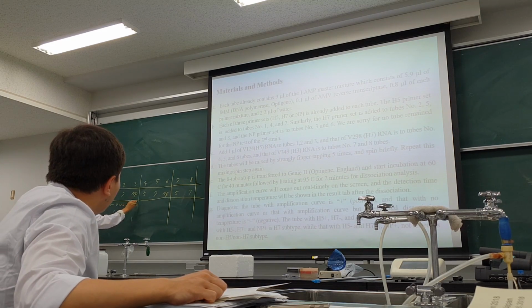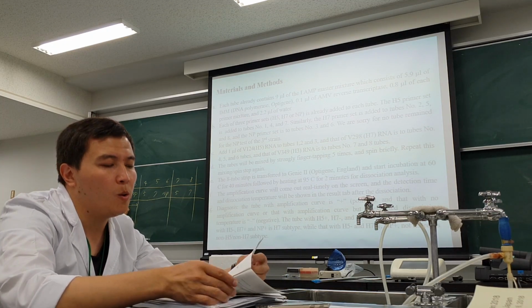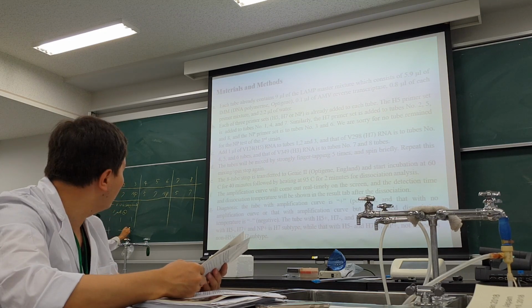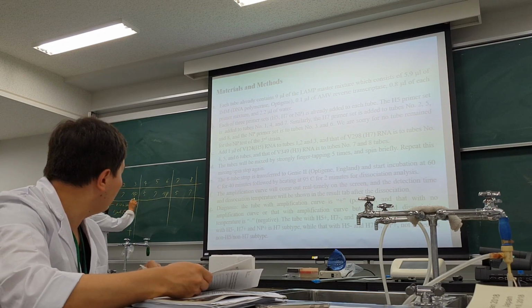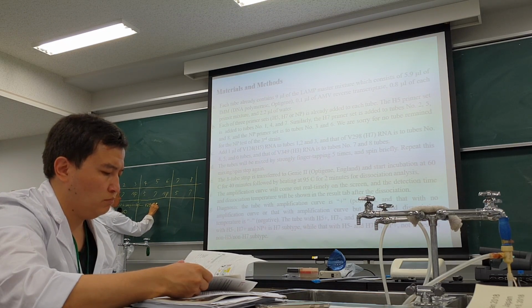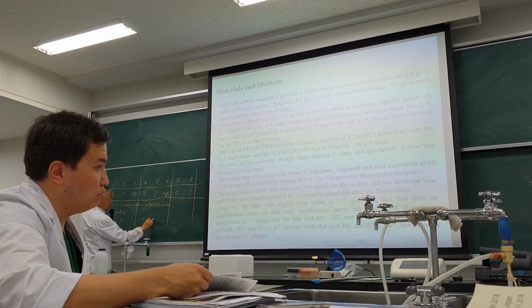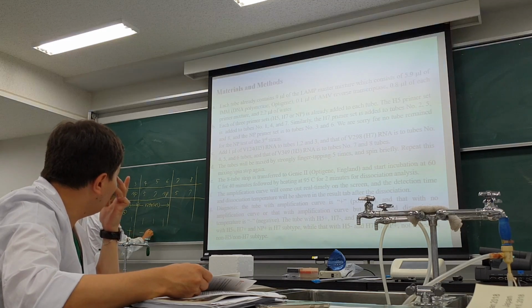Okay, so this is the H5 strain. Expected result should be like this, right? This is the same. Change the tips. Expected result should be like this.